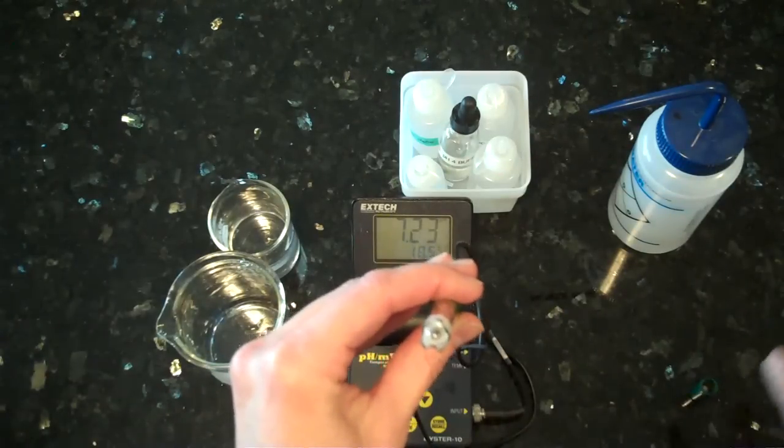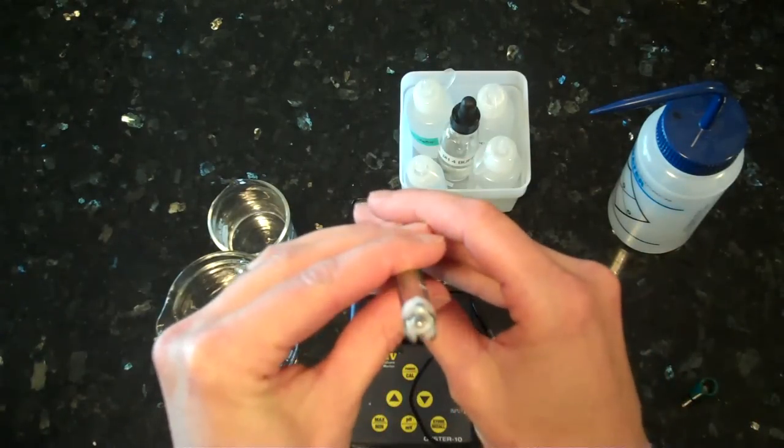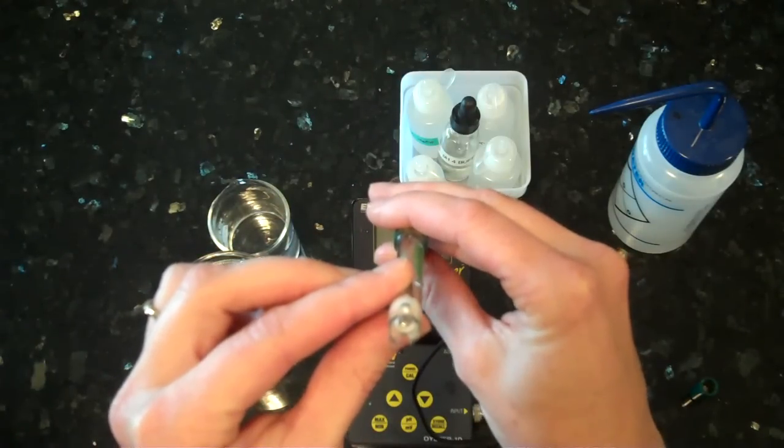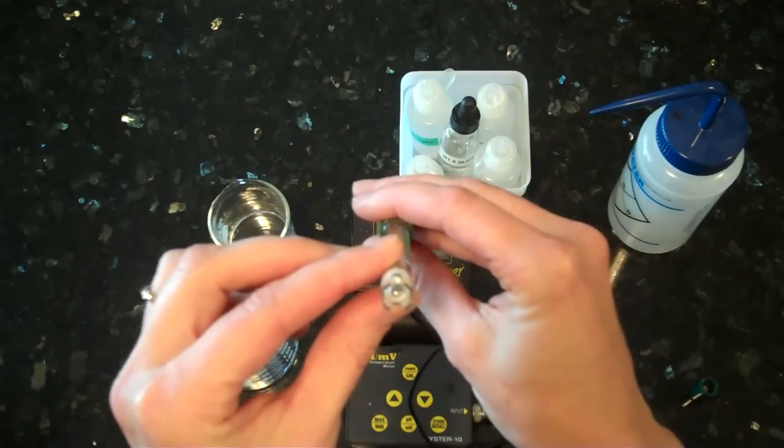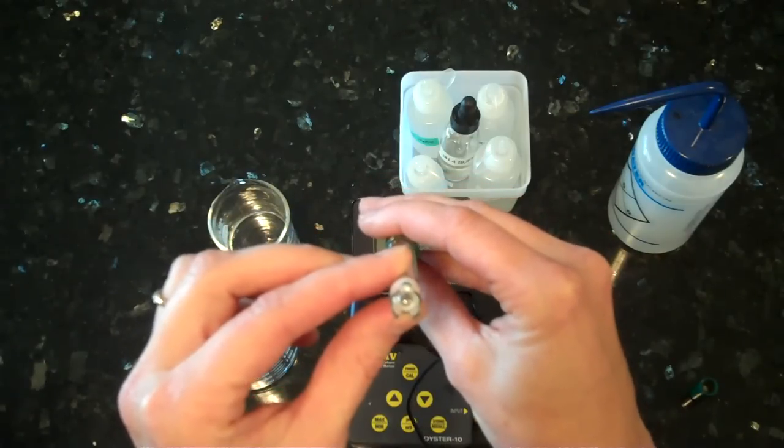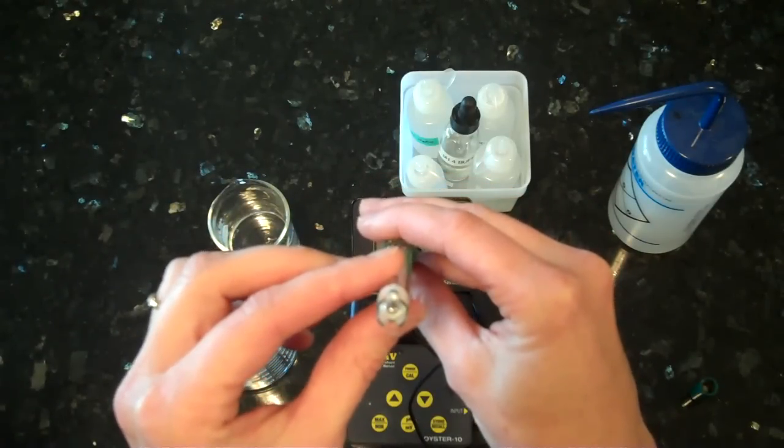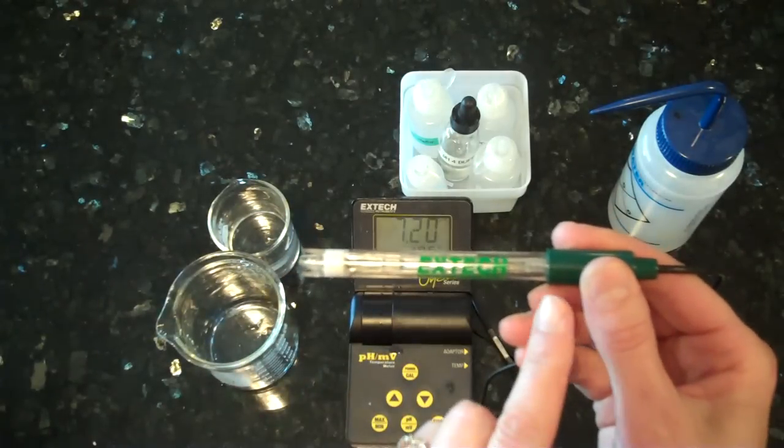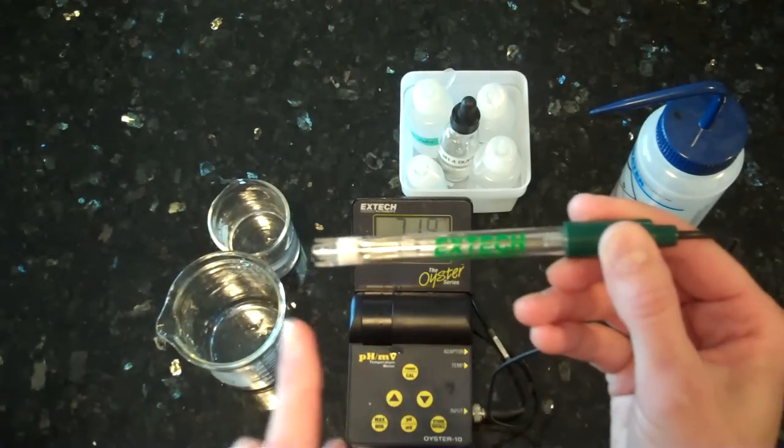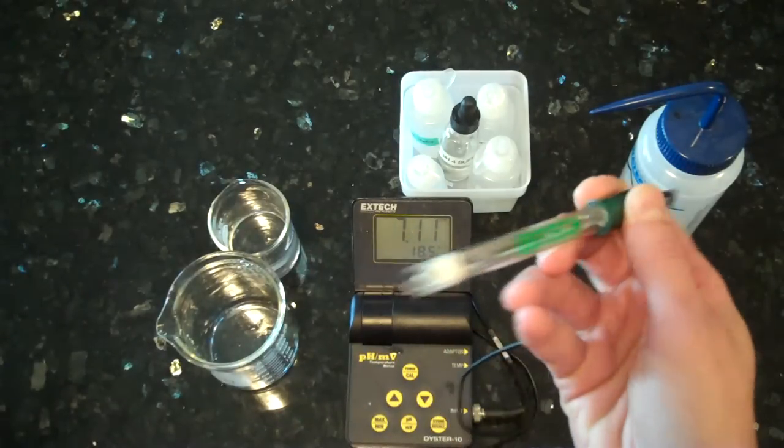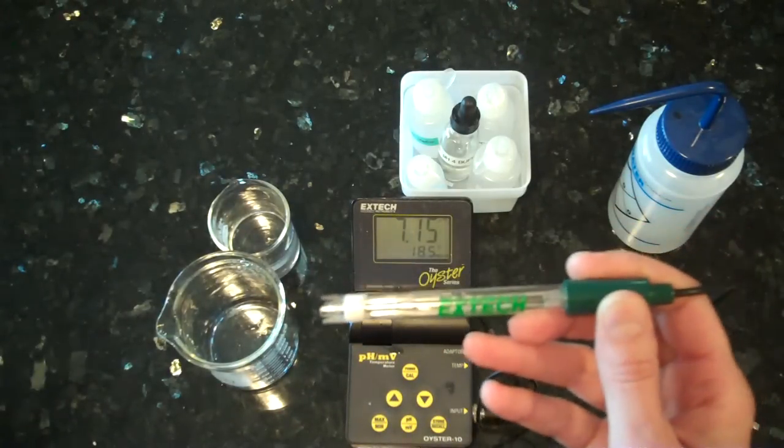The second thing I want you to see is the pH probe itself. If you look inside, you'll see a little glass bulb, and this little glass bulb is actually what does the sampling of the solution. The bulb is very fragile and can break easily, so please be aware that even though it appears to be made of plastic, the sheath only partially covers the bulb, and the bulb can break if not treated properly.